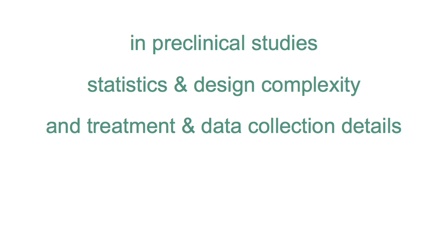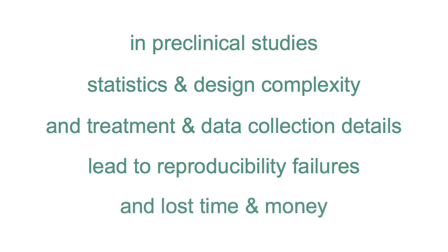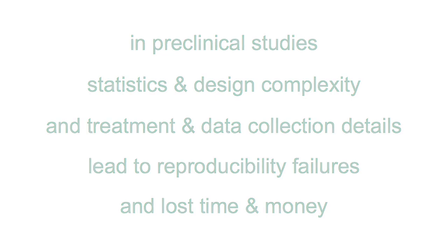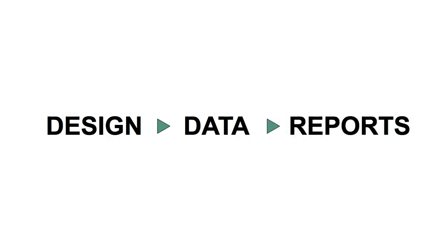This results in animal study findings that are not reproducible in clinical trials and the publication of misleading results. And this means a lot of wasted money, and perhaps more importantly, an enormous amount of wasted time the researcher can never recover. Seralogix helps researchers at each step of the preclinical study process to avoid the errors and the small mistakes that can render study results invalid, so that the researcher's ideas and hypotheses can be fully realized, with significantly higher rates of reproducibility and ultimately greater positive impact on the problem to be solved.